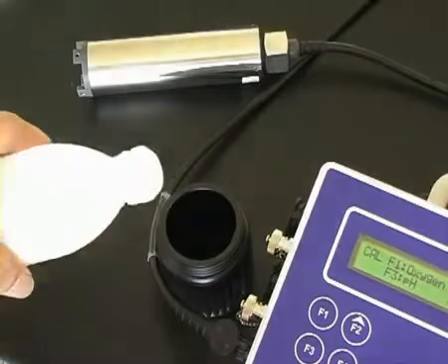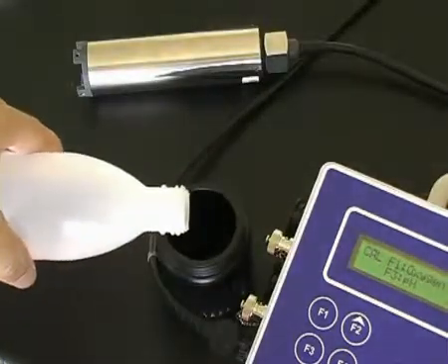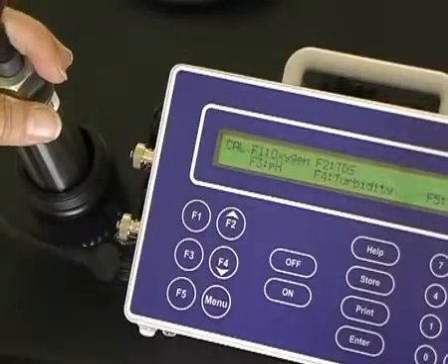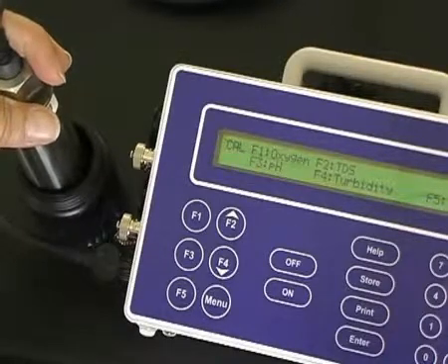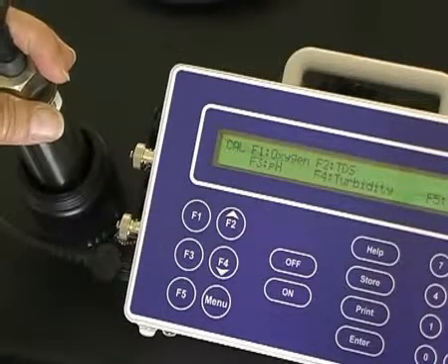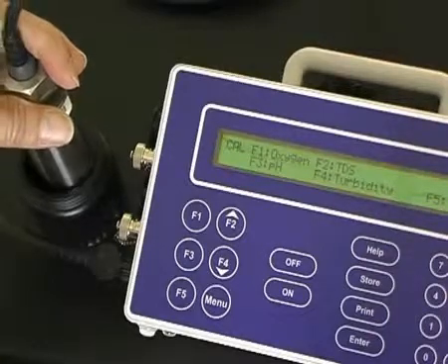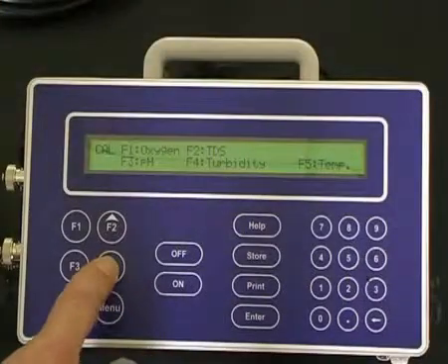Pour the deionized water into the jar. Place the turbidity sensor in the jar, but do not allow it to touch the bottom. It should have at least 30 millimeters underneath and around its sides. Select F4 for turbidity.